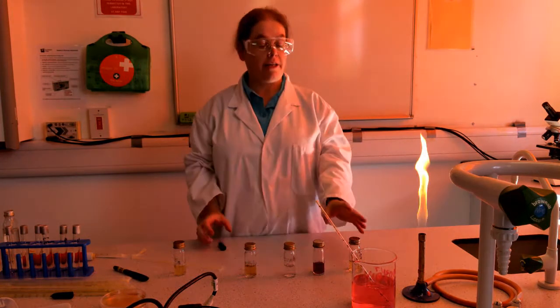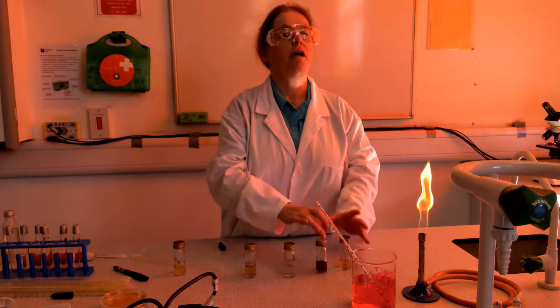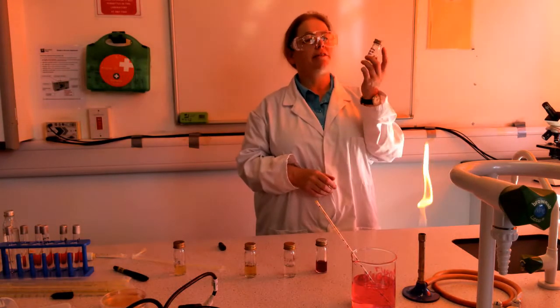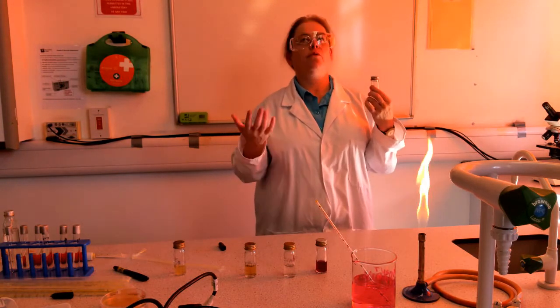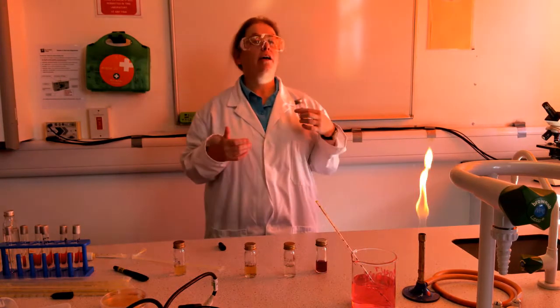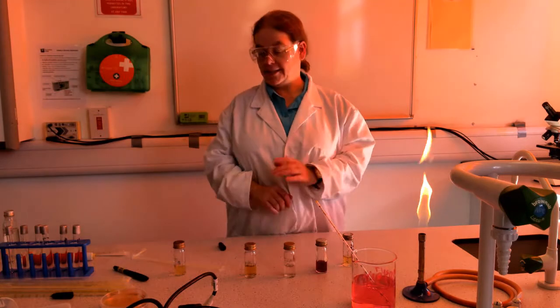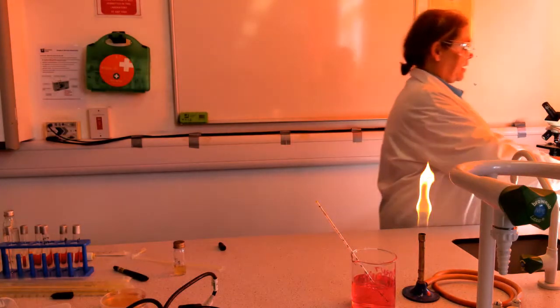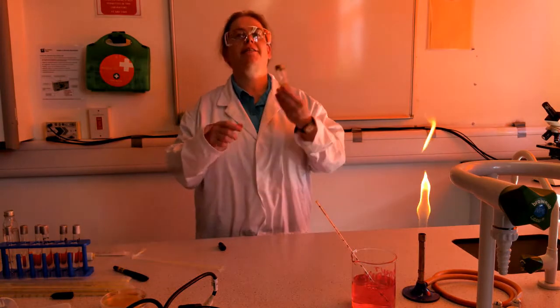And I would obviously repeat that. I would have got you each to repeat this with the 4 different growth media. What happens then is the 4 different growth media, all inoculated with the same amount of the bacterium, would be placed in an incubator, typically for 48 hours, maybe a bit more, and then refrigerated until the next week when you would have come to do the next part of the lesson. Right, so we will assume that has happened. Okay, but I'm not coming back next week. Right, so we will assume it is a week later.